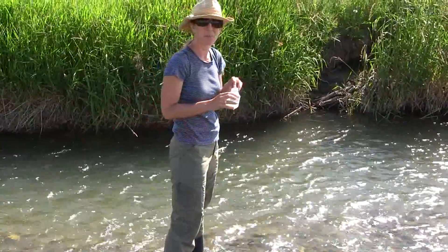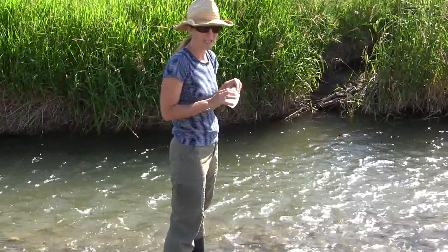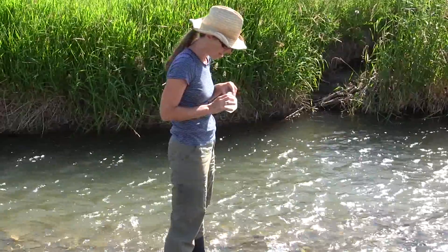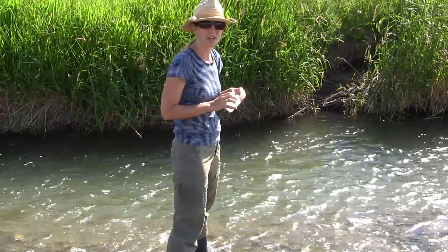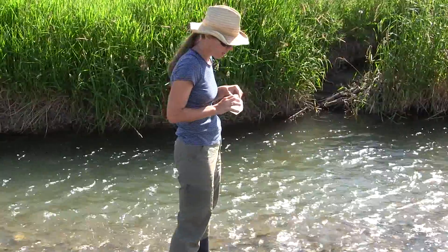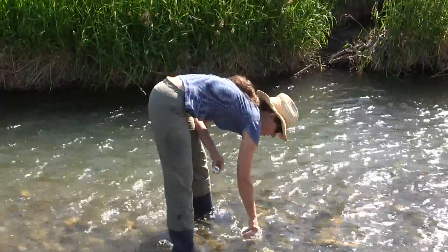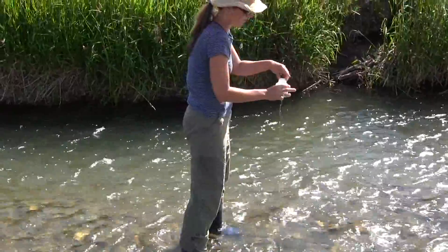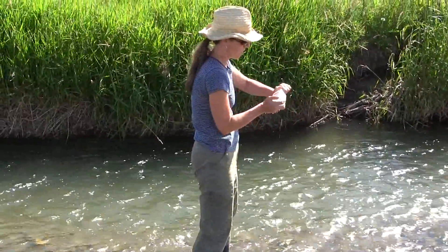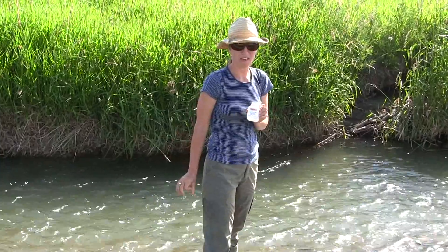Once your bottle is triple rinsed and you're ready to take your sample, put it down underneath the surface of the water while it's inverted, then turn it up so that you're filling it with water coming from beneath the surface. Then screw on the cap firmly and take it to the shore to preserve it if necessary.